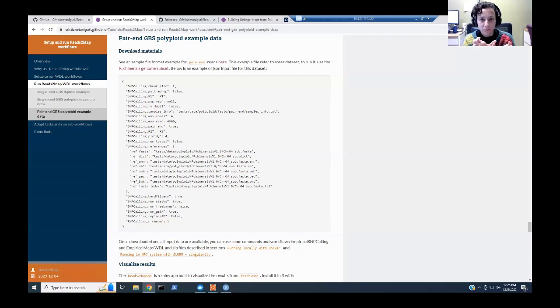The reads overlap a little bit, but they don't start and end in the same position. And for WGS, these can be confounded with errors, the Illumina platform errors when one slot invades another slot, so you get confused about which read is different or which is similar. So in WGS, we prefer to eliminate them, because they are not the majority of the data set. But for GBS, they are. So you should not remove them for GBS.